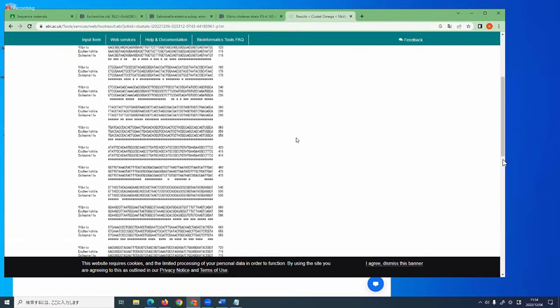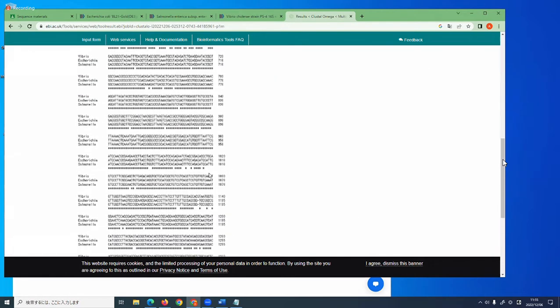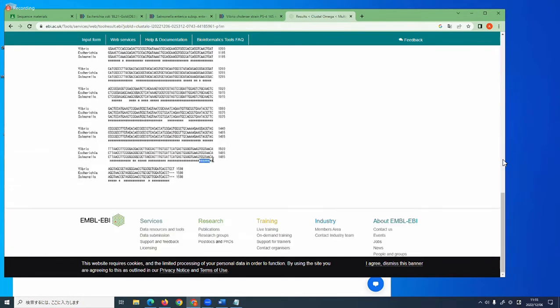And this is because 16S is very highly conserved. So if you were to design a primer that will work for all 3 of these, which is useful if you want to use it as a sequencing primer and so on, you will find the conserved region, right? Similarly, like before, this is a very easy thing to do because it's very conserved here. And the one below here is very conserved as well. To be able to sequence, but the problem is the primer we design, let's say minimum we want 15 base pair, 15 nucleotides of primer.